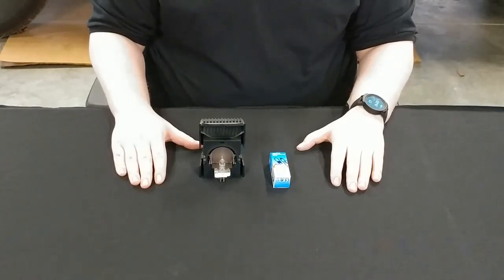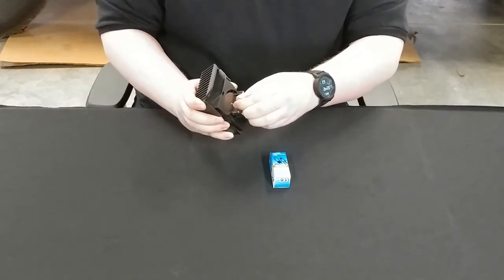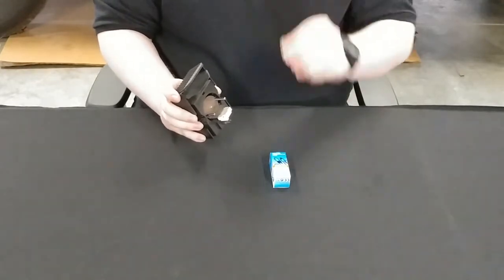Now we're going to go about replacing the bulb. Take your lamp house and remove the old bulb. It's going to be in there a bit stiff, so just wiggle it a bit and it'll pop right out. Dispose of this in the proper receptacle.